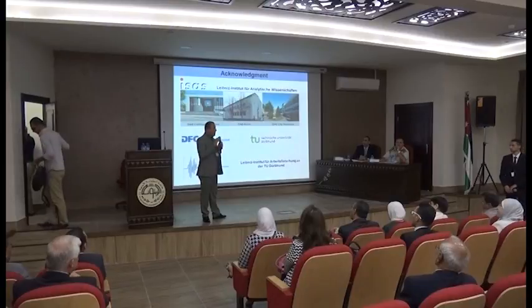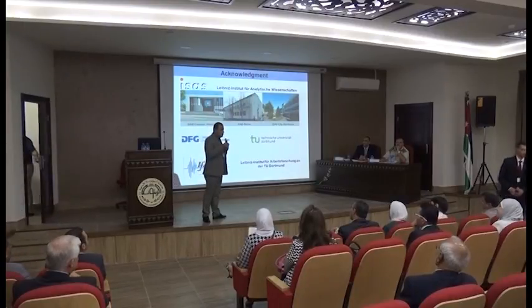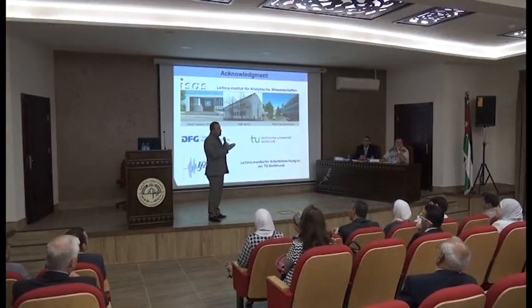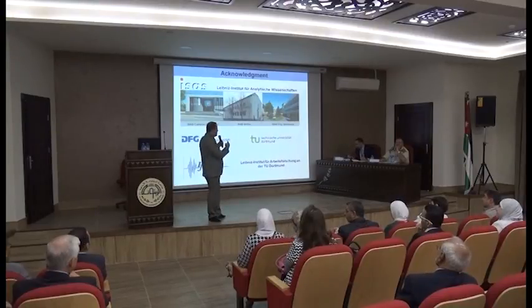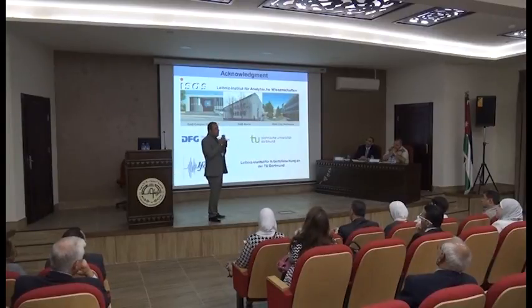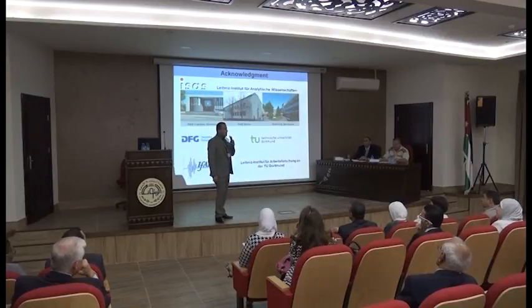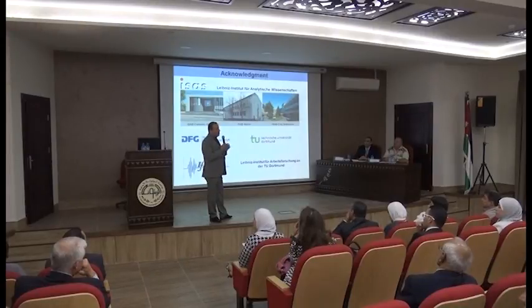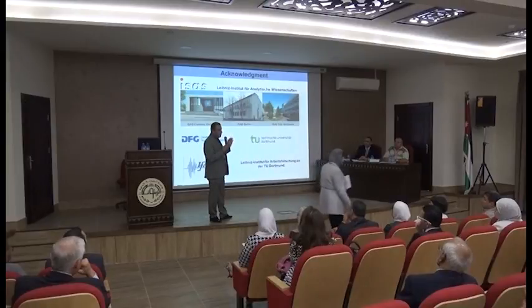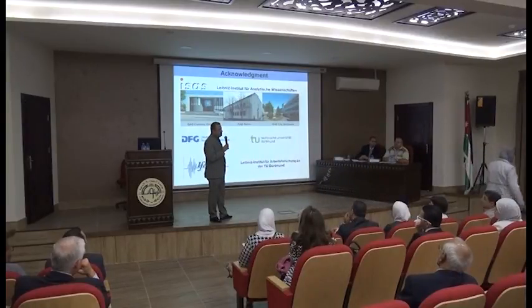Yes. Actually, we are using liquid state NMR without magic angle spinning. We have another machine for magic angle spinning for tissue, because it's a gel, between liquid and solid state NMR. This is liquid state NMR, and we also have research now to improve on dipole-dipole interaction, to remove it by using another technique called selective pulse excitation. We are working on this. We have some basic results, but it's promising. So in this research, we are using magic angle spinning only for tissue, it's a normal pulse, and it's sufficient for liquid state NMR.